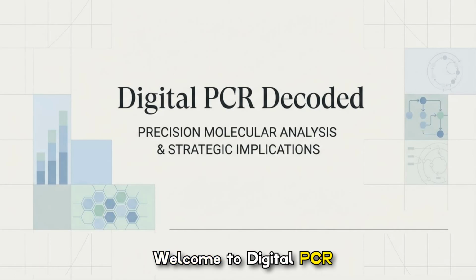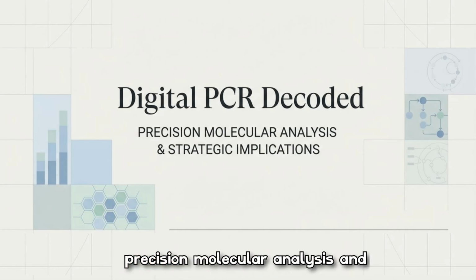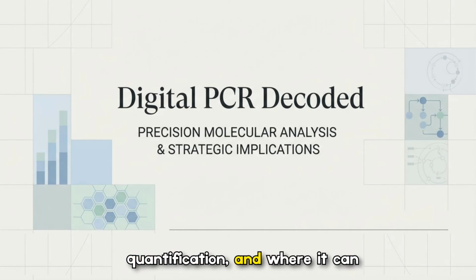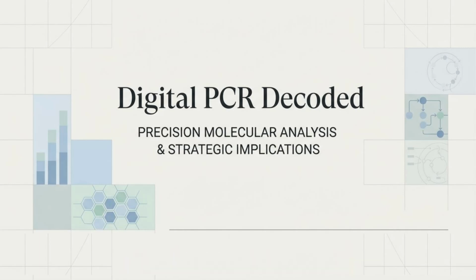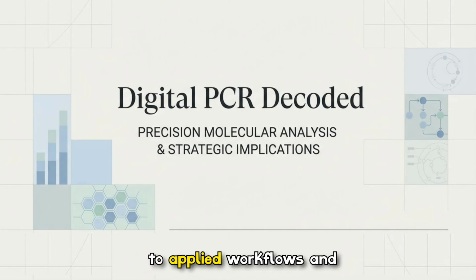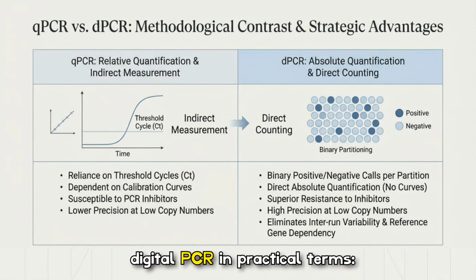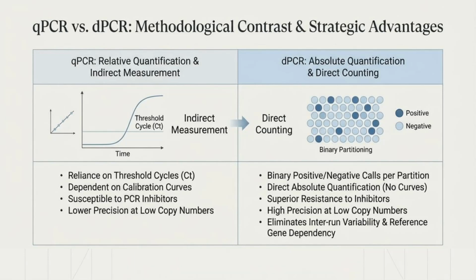Welcome to Digital PCR Decoded, where we unpack precision molecular analysis and its strategic implications. In this presentation, we'll explore how digital PCR works, why it changes the rules for absolute quantification, and where it can make the biggest impact in research and clinical settings, guiding you from core concepts to applied workflows and real-world use cases. This slide contrasts qPCR and digital PCR in practical terms.